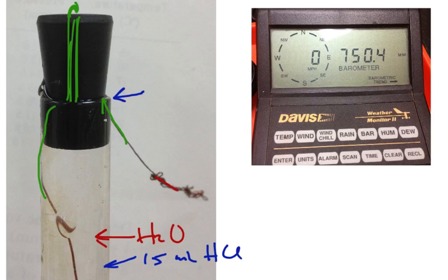Put the stopper in, and there is a hole in the end of the stopper, and that's good because as the hydrogen gas forms, it's going to push the water out that tube. Now you're going to take this whole thing, turn it upside down in a beaker, and you're going to watch for the Schlieren, and you're going to capture the size of that big bubble.